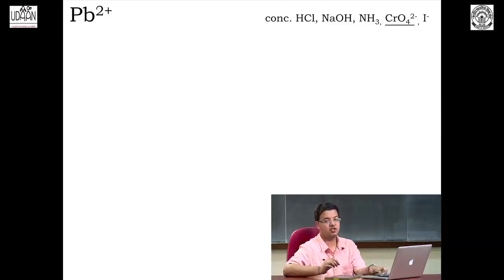For example, as you shall see, in group 2, the group reagent is acidic solution with hydrogen sulfide reagent. This will give precipitates of all metallic cations in group 2 because of their low solubilities. But if somebody did not carry out group 1 analysis and separated out the cations of group 1 in the form of their precipitates out of the solution, for example Ag+, that will also give its sulfide precipitate under a similar set of conditions. So therefore, this order is important systematically also.